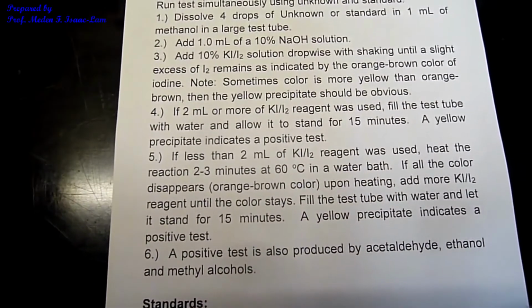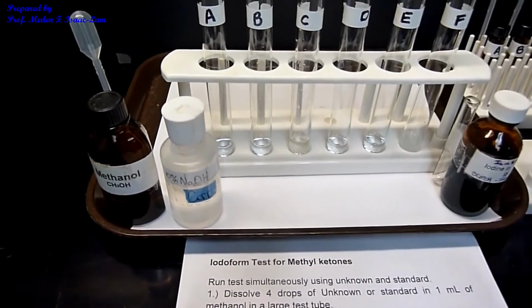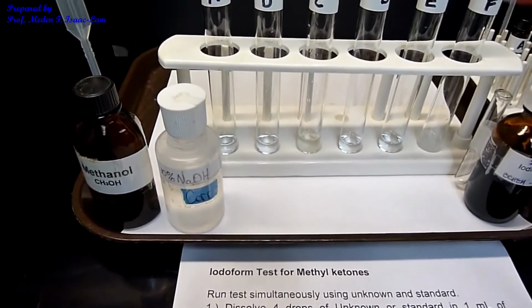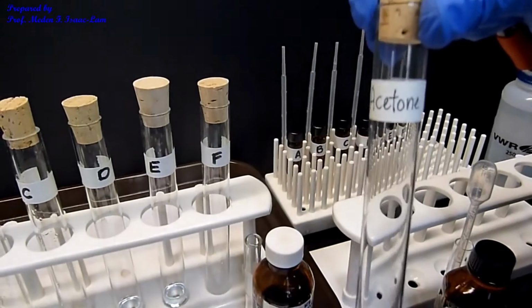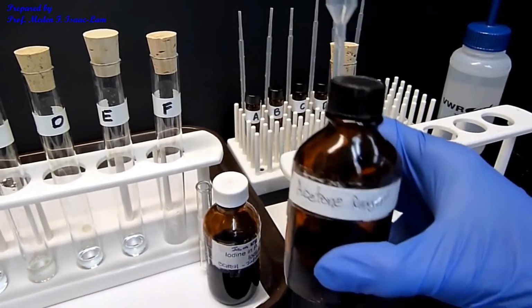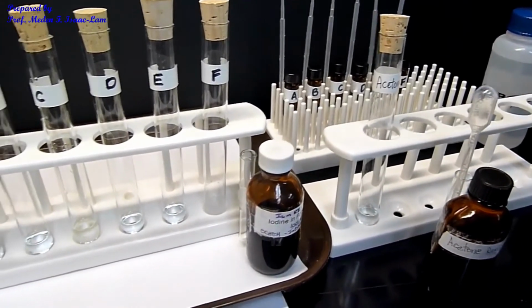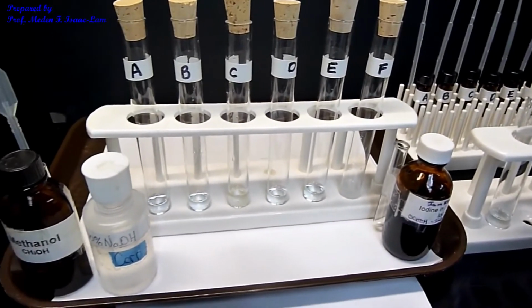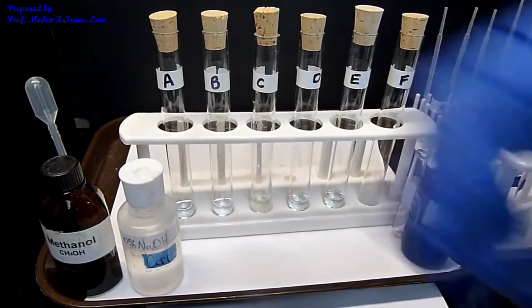Iodoform is CHI3. I already added in this large test tube 4 drops of each of the unknowns, A, B, C, D, E, F. And then I also have a standard, which is the acetone. So acetone is the standard, and then I added 4 drops of it. And then I also dissolved this in 1 ml of methanol.